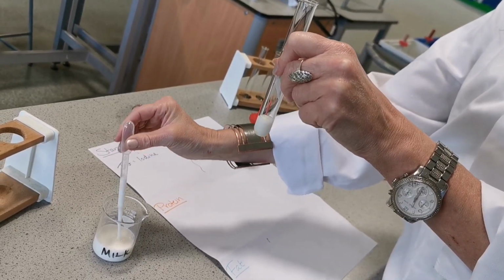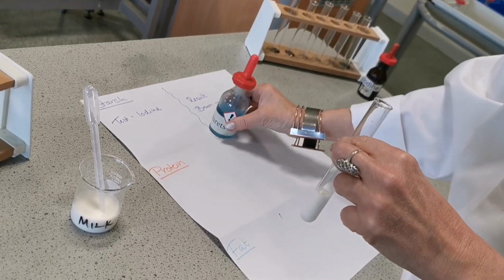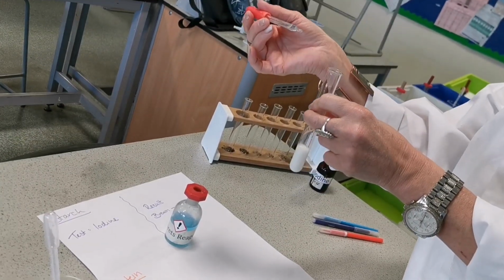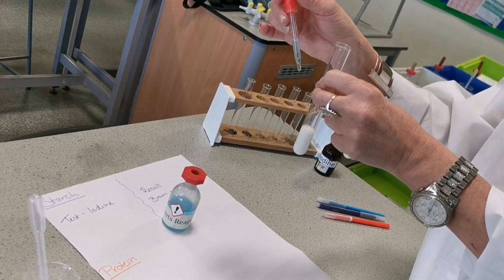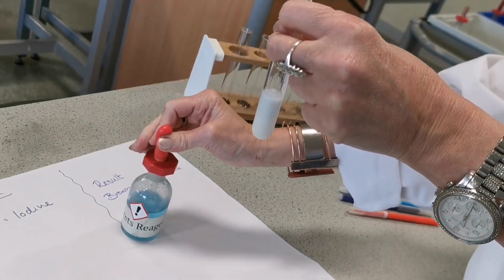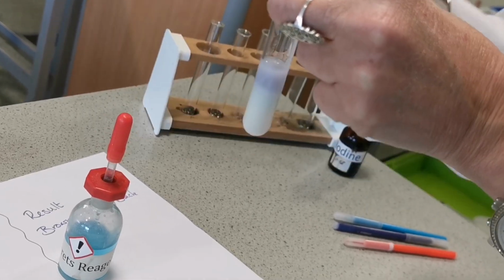Let's put a little bit more in with that. This is called a pipette. So remember those key words you need: pipette, test tube, beaker. I'm then going to use the dropper to add some biuret. If we have a positive result, so if there is protein present here, this should turn a lilac purple colour. So you can see it's just starting to change colour now. I'm going to add a little bit more. Oh, and you can see that turning nicely.